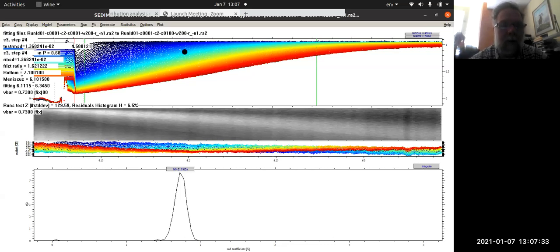The new machine is much faster at doing scans, so we asked it to do 100 scans in like 10 hours, and what it did is it did 100 scans and then it did nothing for the next like 6 or 7 hours when it was already done with 100 scans. If I had asked it properly to do like 400 scans over the course of 10 hours, I would have some data in this region here where you'd be able to see some of the effect of what the protein was doing at later times. And that gives you some more accuracy at actually calculating a molecular weight because you have more accuracy at getting a diffusion constant. So let's skip that for now.